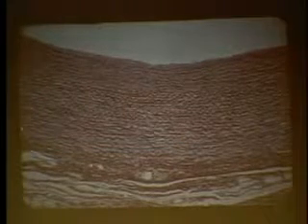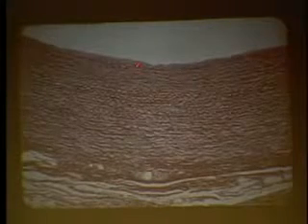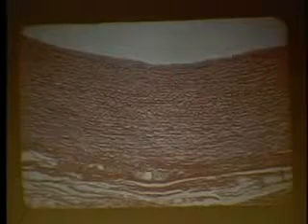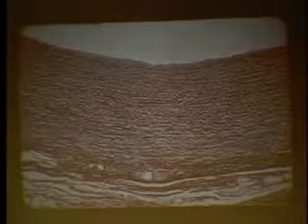New slide. What kind of an artery is this? Pardon? Elastic artery. Right. You don't see the muscle, you don't see anything but little wavy lines which are elastic fibers. So when it expands after the heartbeat, these can contract and help propel the blood.